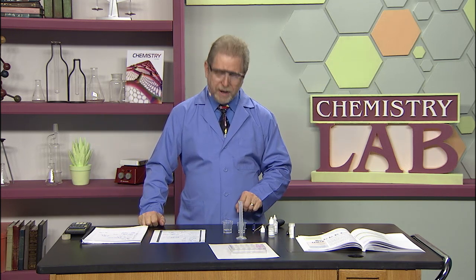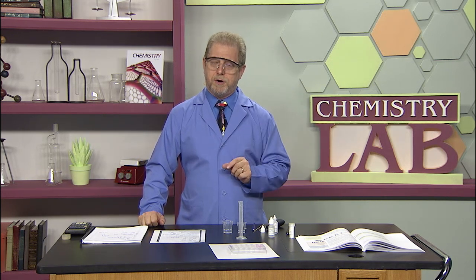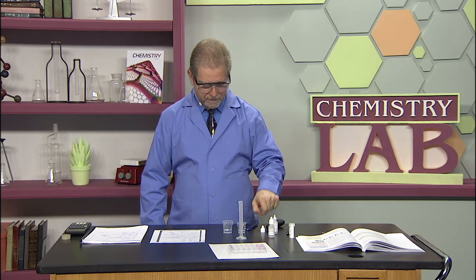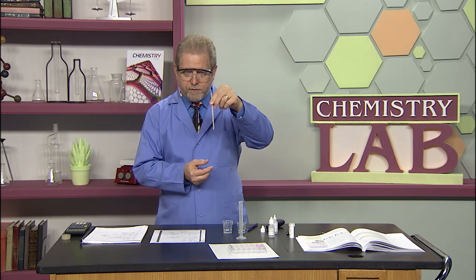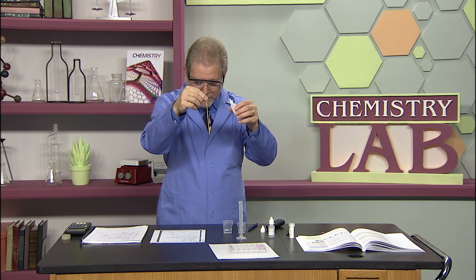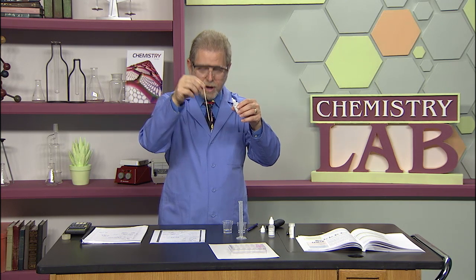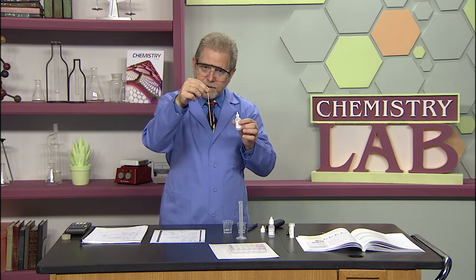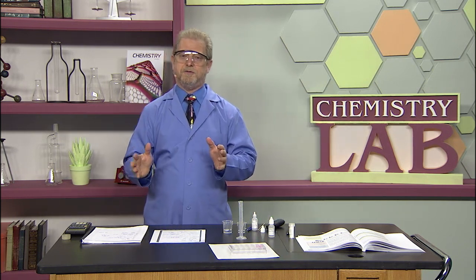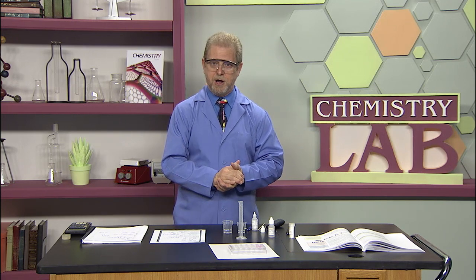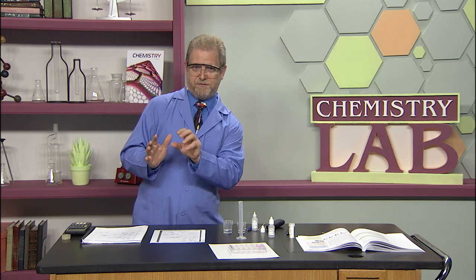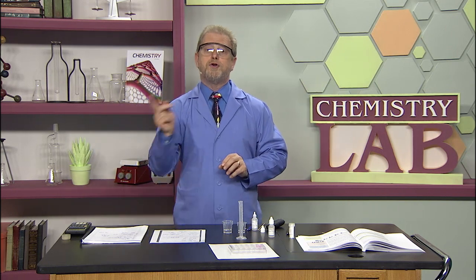This is really a good lab because you get to see how a titration works. You've got to be very careful. You want to go drop wise, one drop. Stir, stir. As a matter of fact, you have your dropper in one hand, drop, stir, stir, stir. It's gone. Drop. Until that last drop, the color persists for at least 10 seconds of stirring before it disappears. It never really disappears, it just gets fainter and fainter if you go too far.